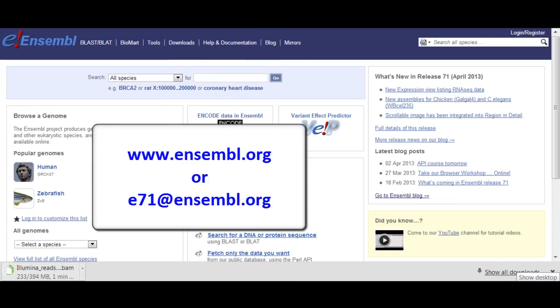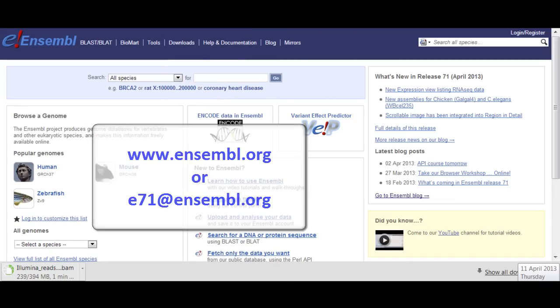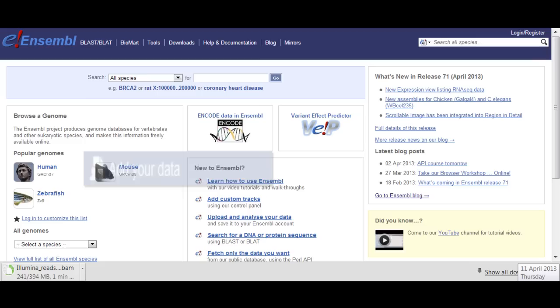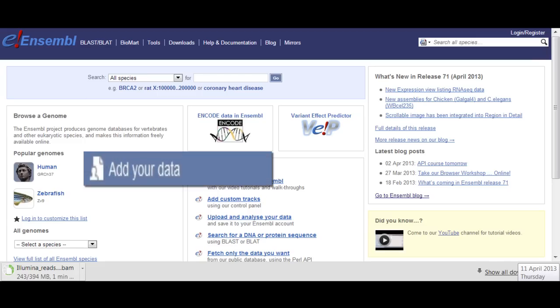Hi, I'm Julieta from the Ensembl outreach team. How can you view your own data in Ensembl? There are multiple ways to do this.